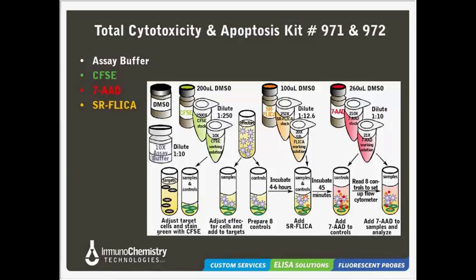And again, if studying the effects of a drug or toxic agent, the CFSE staining is optional if you're not going to be mixing it with the effector cells. Assuming you're mixing it with effector cells, you would add those next, which are unstained, and then incubate. After incubation, you'd add our SR-FLICA reagent.